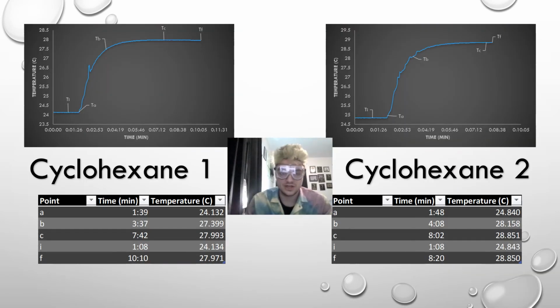So the readout that you get from this combustion process is something like this curve here, which drastically increases and then plateaus as the temperature gets higher. Now, the points of interest for both trials here are the initial temperature, which corresponds to Ti. This value is the temperature where the water bath has equilibrated about a minute into the process. Ta corresponds to the ignition time and the ignition temperature. Tc is the max temperature of combustion. Tf is the final temperature of the process, and then Tb is 60% between Tc and Ta.